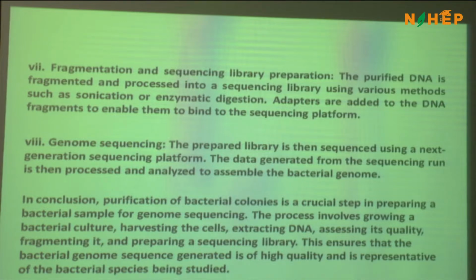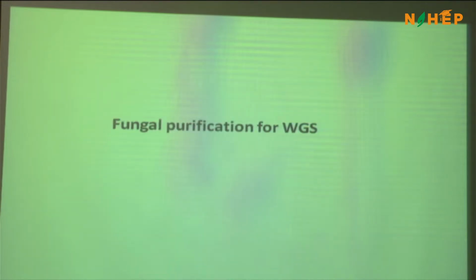So now you have 1 ml microbiome, total phyllosphere. And I'm sure the story is the same for rhizosphere also. You can go for repeated washing, right? And this 1 ml is again segregated into the 4 things I already told you. Something can go for metabarcoding or metagenomics, something can go for plating out in serial dilution plating, something can go for imaging, something can go for preservation, right? So that is all about the biological sample preparation for bacteria.